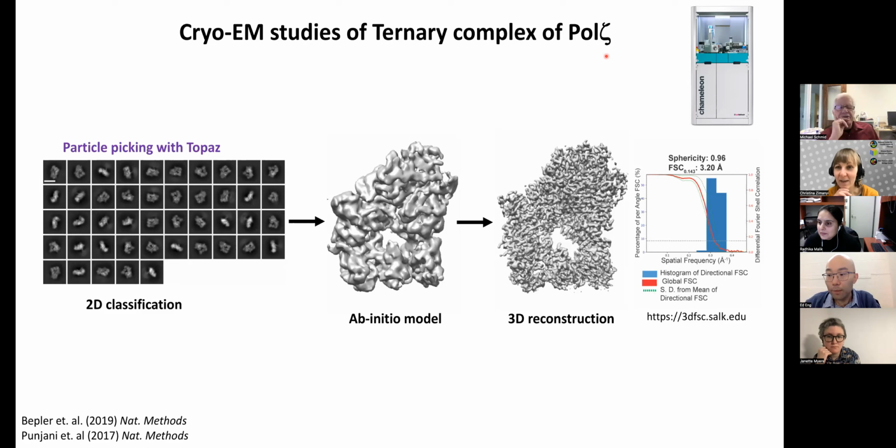I have a question. It seems like you basically had two separate kinds of solutions to the preferred orientation problem. You tried tilting, and that worked for some things. You tried Chameleon, which worked for other things. Do you recommend looking at all kinds of different ways to solve the preferred orientation problem, or should you try one first and then go to others?